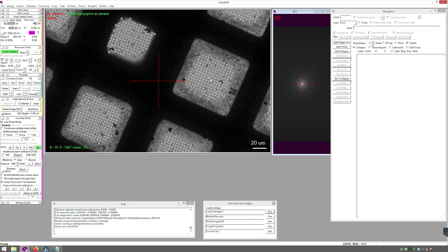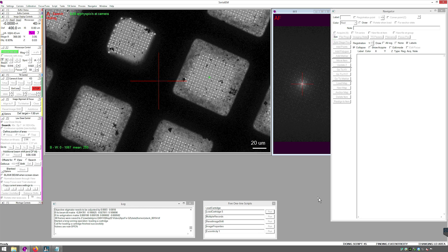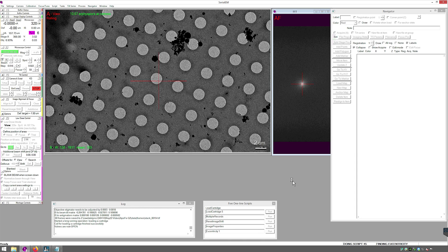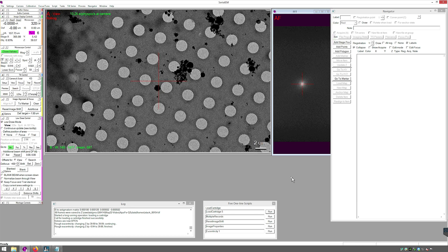Next, navigate to a grid square near the center and run Rough Eucentric. After Rough Eucentric completes, collect a low magnification montage.